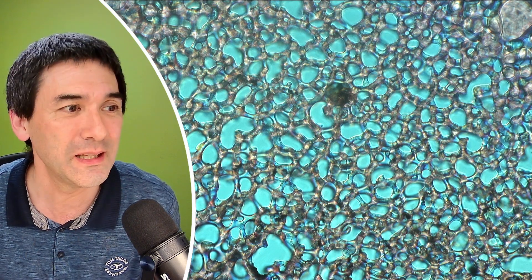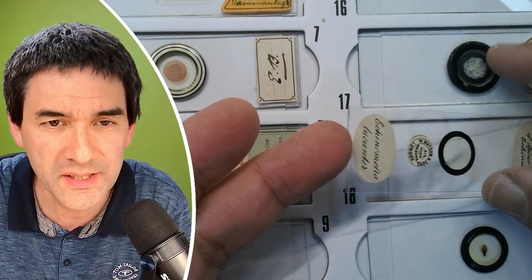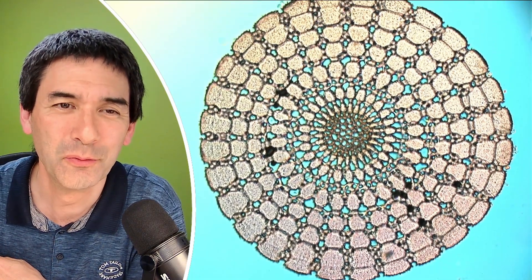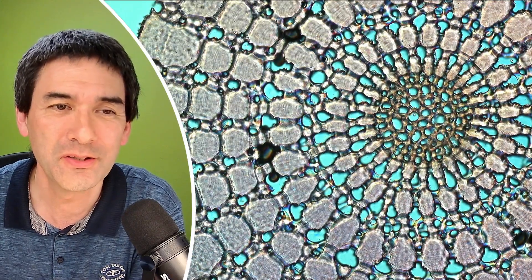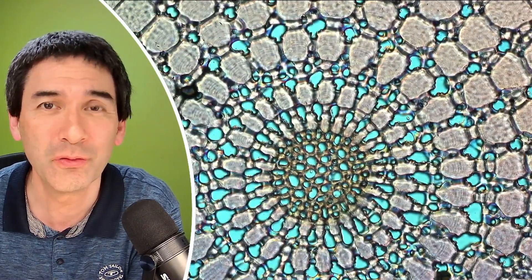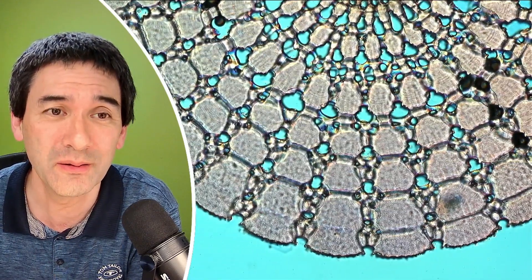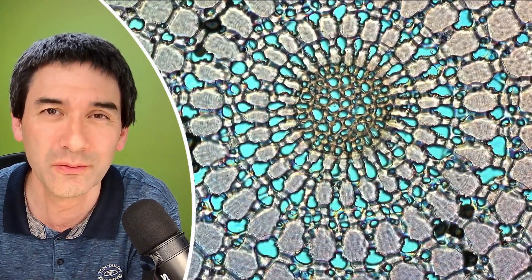Let's have a look again at this light box. Here's another cross-section of a sea urchin spine made by the same company. Isn't this beautiful? The patterns of nature are really, really nice. So this is basically another activity that I like to do — I like to collect slides as well. Not because of a possible value they might have, but simply because I like the history that's behind it. And you can actually see that the people who made those microscope slides really loved what they were doing.